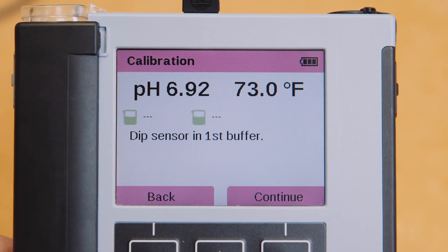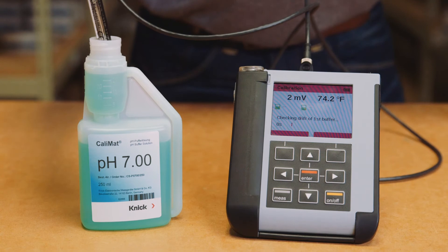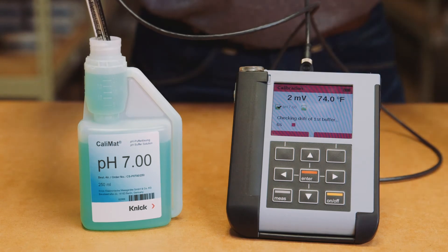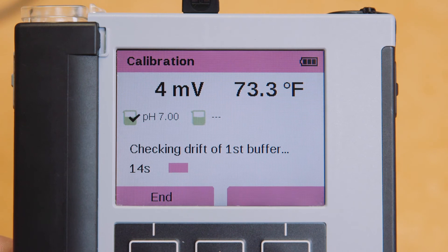It's also very important to let the values on the top of your Portavo screen stabilize. Once the values have stabilized, press the Continue button. After pressing Continue, the Portavo checks the drift of the first buffer solution. It displays the millivolt output generated by the sensor in the first buffer solution as well as the measured temperature value. The Portavo automatically indicates a buffer value of 7.00 based on the millivolt output of the sensor.